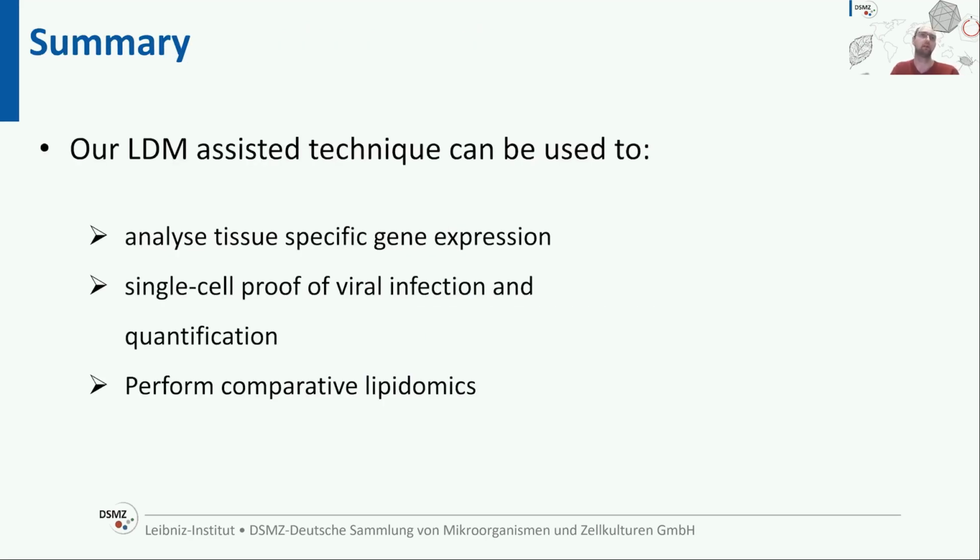We can use our LDM techniques to either analyze tissue-specific gene expression, or we can also probe out of single cells if they are infected by a virus, and can also quantify the amount of viral DNA. And additionally, in collaboration with our metabolomics facility, we can perform comparative lipidomics.